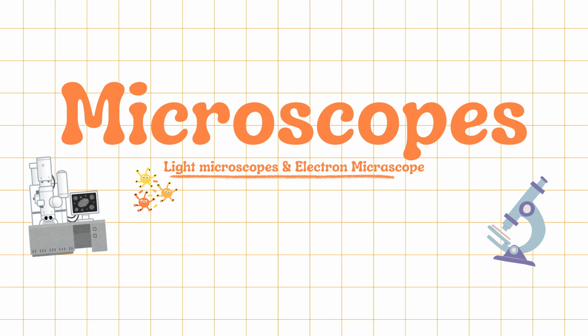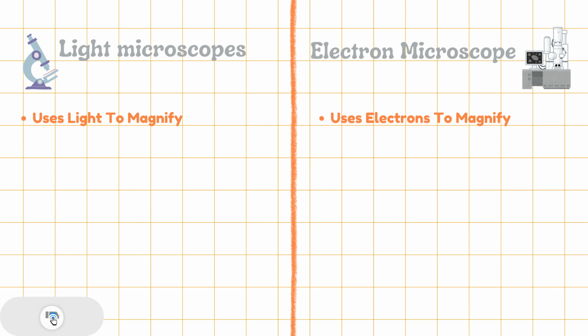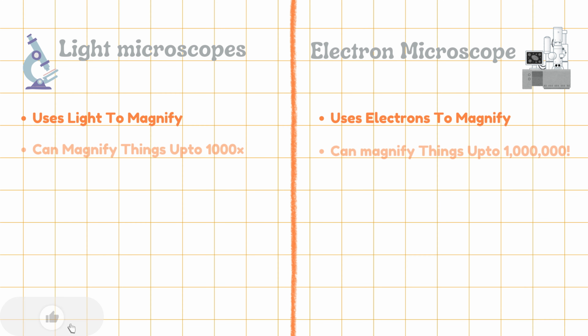So in this video we're gonna learn about two types of microscopes, light microscope and electron microscope. So let's begin. Light microscope. A light microscope uses light to magnify, but an electron microscope uses electrons to magnify. A light microscope can magnify things up to 1000 times, but an electron microscope can magnify things up to 1 million times. That's a lot.